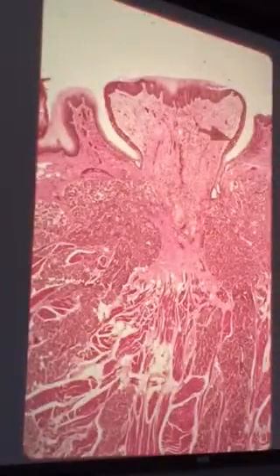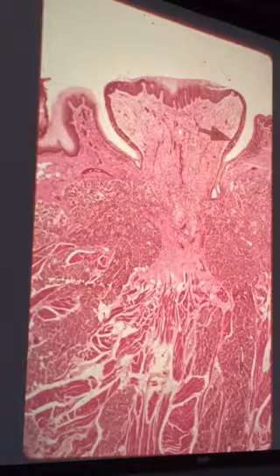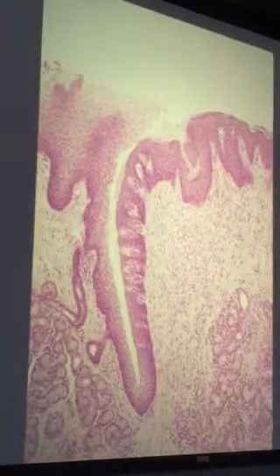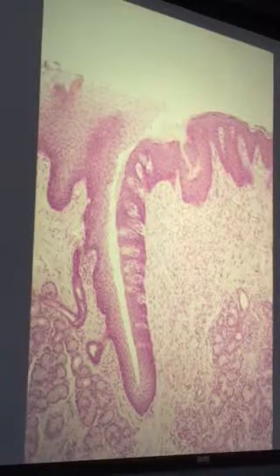And a closer view, and yes indeed this is keratinized. You can see the stratum granulosum right there. And the lamina propria. And these things show up nice and bright and red because of the rich vasculature in the lamina propria. And how about this one? Circumvallate papilla or vallate papilla, either one would be correct. And these structures right here and right there, glands of von Ebner. And how about these things right there? Taste buds. And more of the glands of von Ebner right there. In fact, we have a duct really going into the crypt.